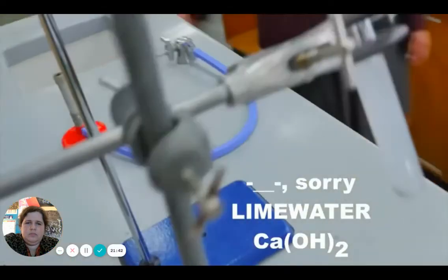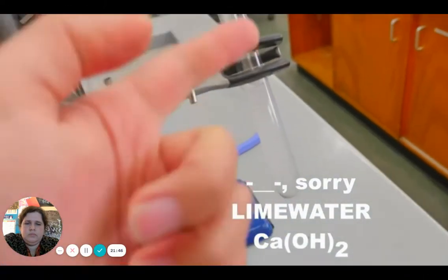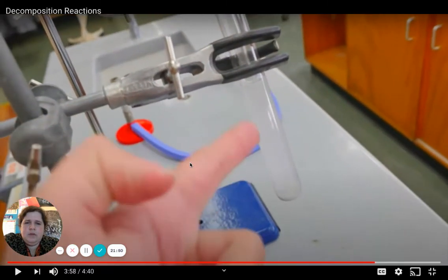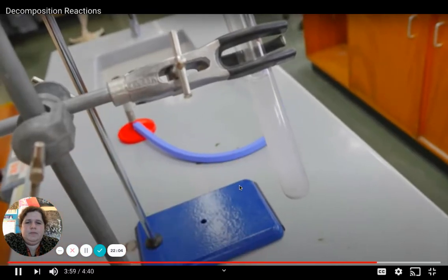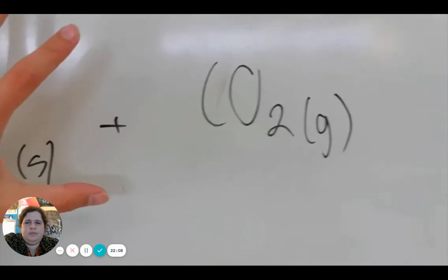the quicklime. The lime water over here. So this one here would tell us the difference between oxygen gas or carbon dioxide gas. And we've got a pop. So the oxygen gas would just bubble out and it'd still be clear. Carbon dioxide gas reacts with the calcium hydroxide and forms this precipitate that looks like kind of a milky solution. Positive reading for carbon dioxide. So from that, we know that one of our products has to be CO2.